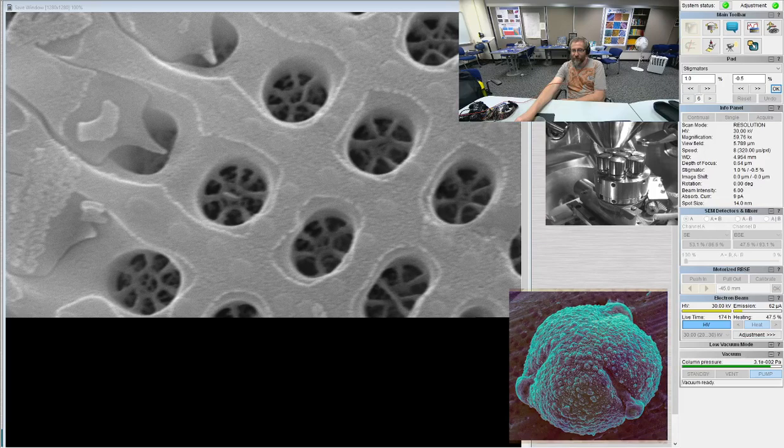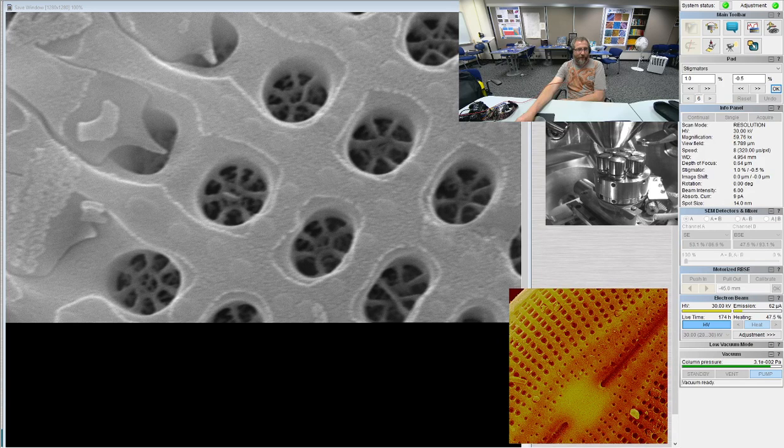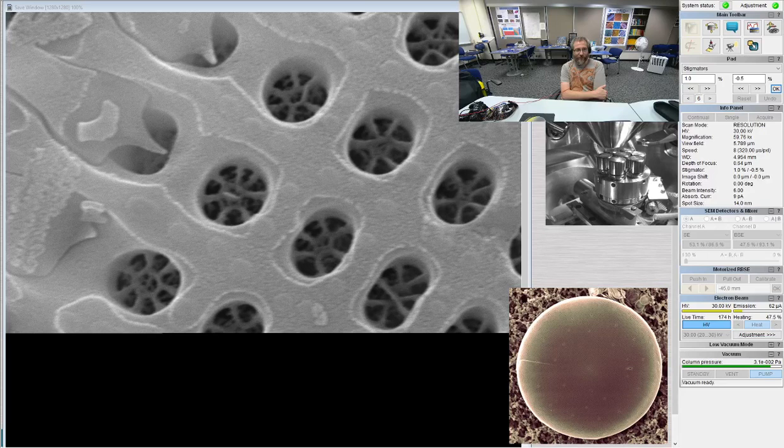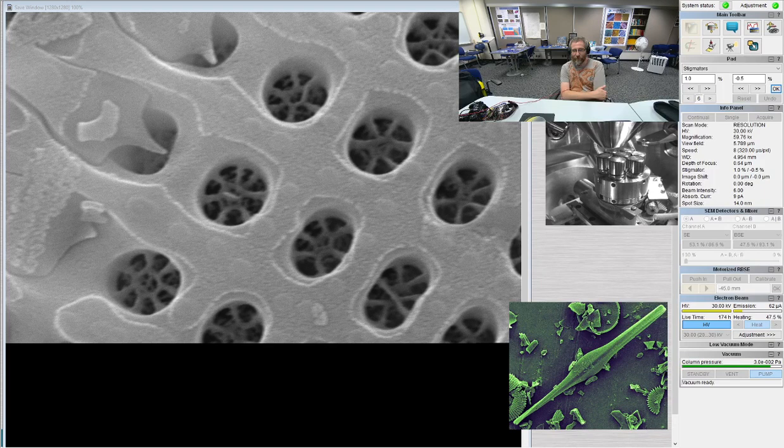We're on the super, super slow build, but I think it's going to be worth it. This photo is just a little fuzzy, but I figure I could probably correct the fuzziness a bit. So, it has no lack of taxonomic description, though. We can go into way too much detail about the pore coverings from this picture.